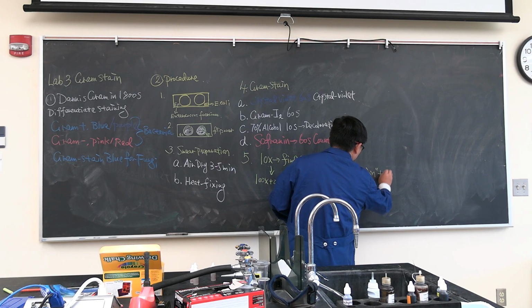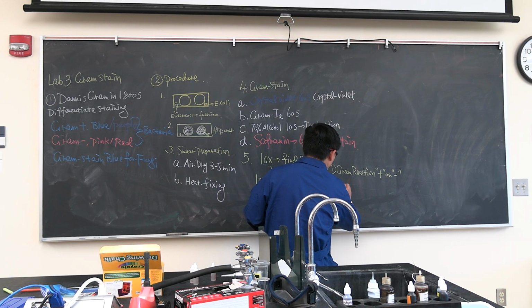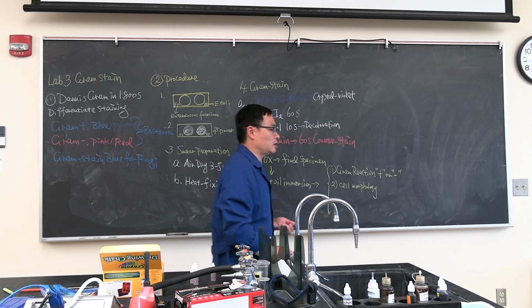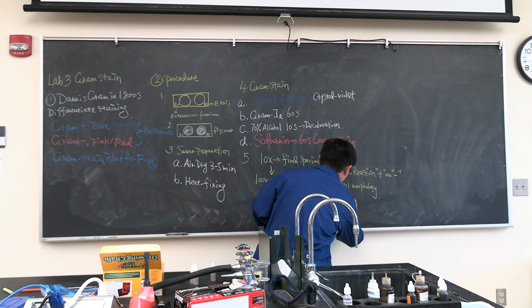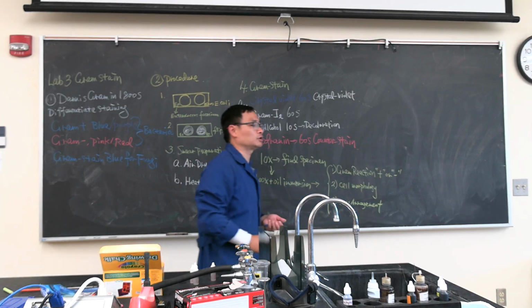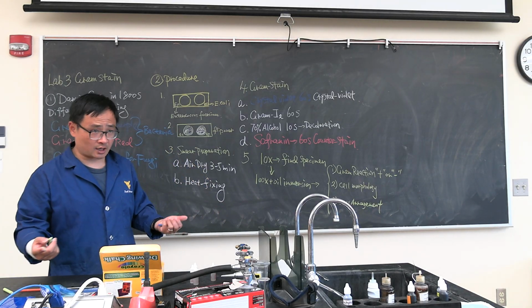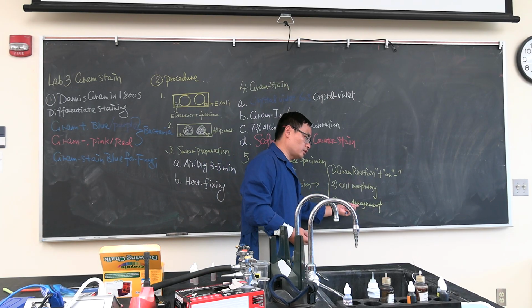This is simple, positive or negative. Number 2 is cell morphology, which means the shape of the cell. It could be a coccus, it could be a rod, it could be a vibrio. The last one is cell arrangement. It could be tetrad, it could be chain, maybe single arrangement, or maybe cluster like a grape shape. These are the important information we have to record. Okay.